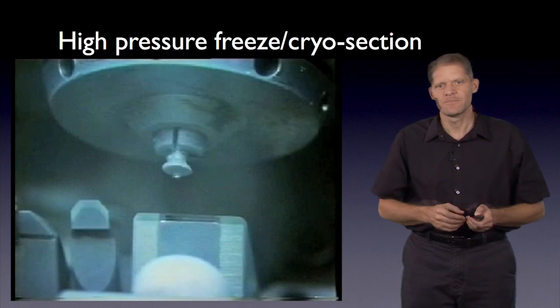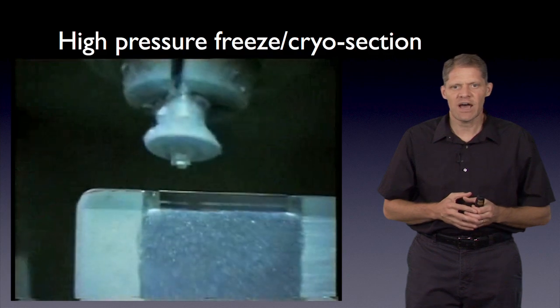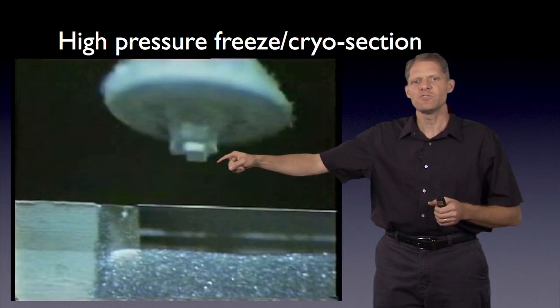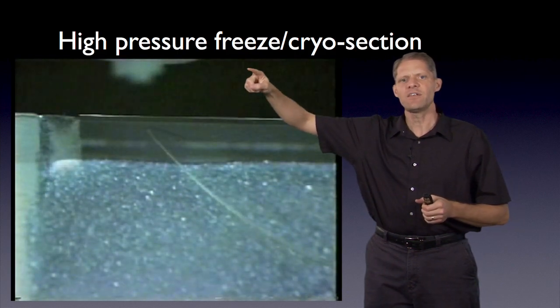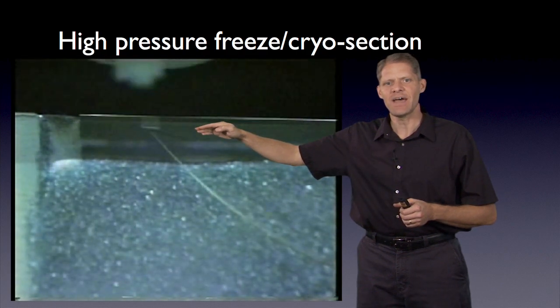Nevertheless, if we want to image a frozen cell within the electron microscope, it is possible to first high-pressure freeze a block of tissue and then section it in the frozen state, a process that we call cryosectioning. This is a movie that was recorded by my colleague Alistair McDowell and his colleagues. What we see is a high-pressure frozen block of tissue at the end of a microtome arm. And this here is a diamond knife.